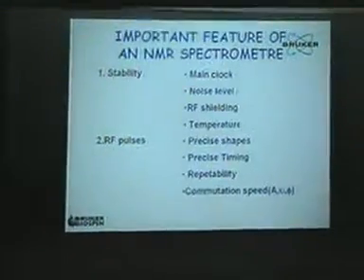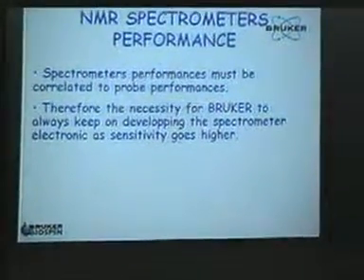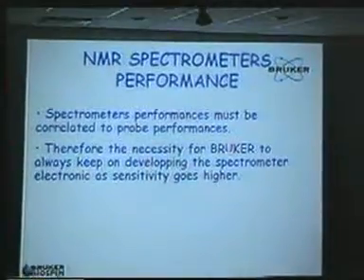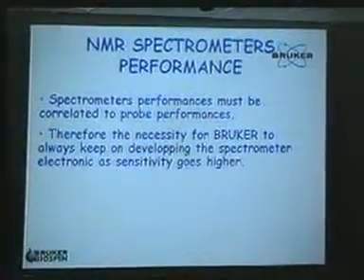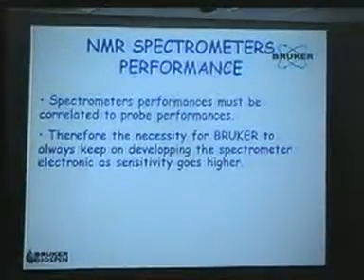Next slide. So spectrometer, oops, please go one backwards. So spectrometer performance must be correlated to probe performance. This is obvious. And therefore the necessity for Bruker to always keep on developing the spectrometer electronic as sensitivity goes higher. Next.